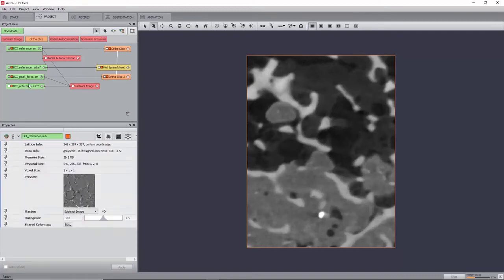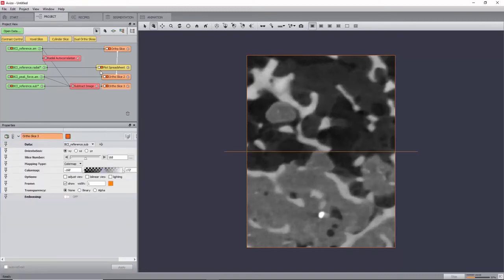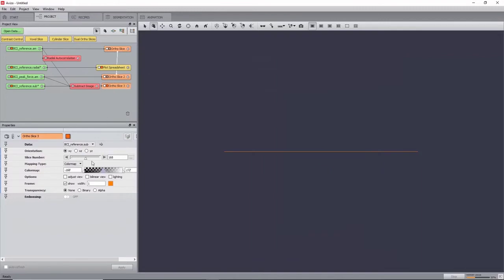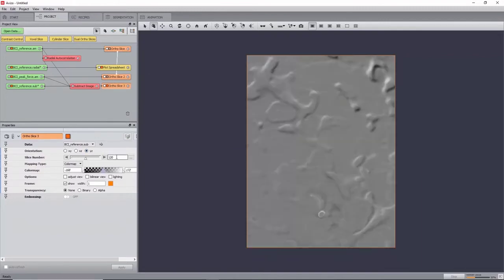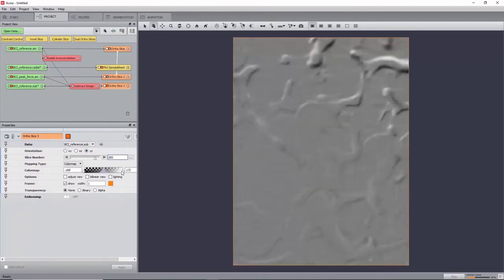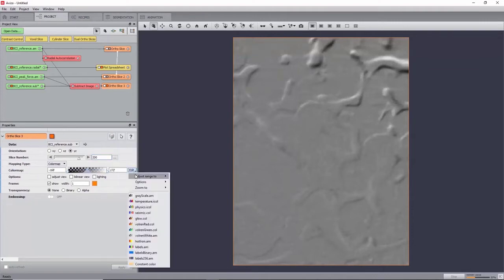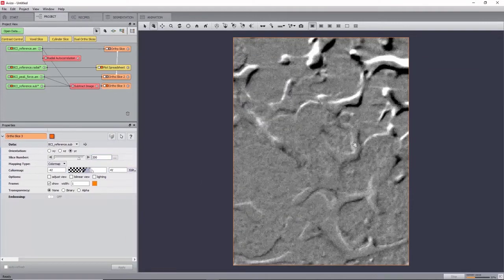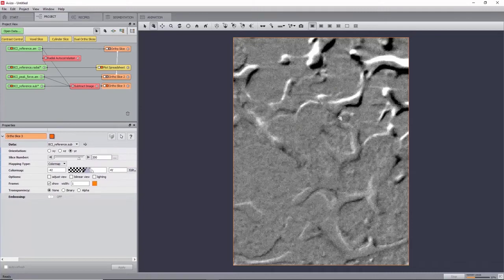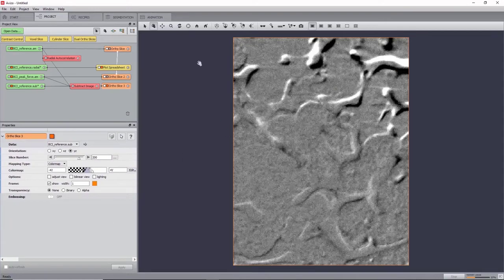View the resulting dataset with an autoslice, and go to slice 200 in the YZ orientation. Adjust the color map by clicking Edit Adjust Range to Data Histogram. Parts with no deformation will appear in grey, and large deformation will appear as black and white fringes.